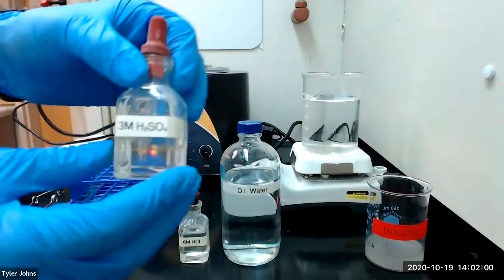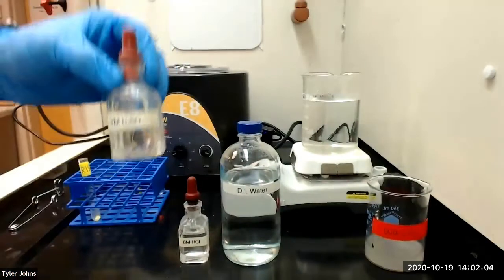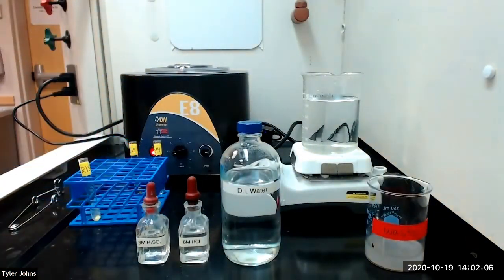We will then add one to two drops of three molar sulfuric acid. A white precipitate of barium sulfate will confirm the presence of barium ion.